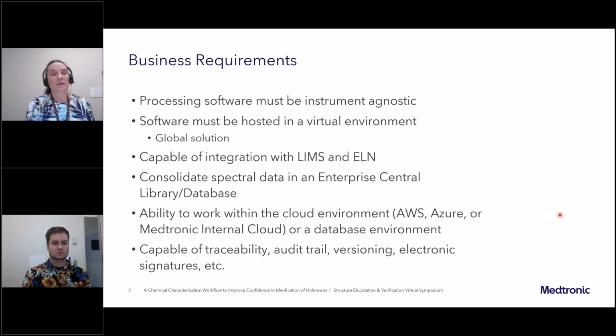We also wanted it capable of integrating with LIMS and with ELN. We wanted to consolidate spectral data in an enterprise central library/database. That library/database we wanted to be portable, not necessarily requiring to be in an Oracle database or, fill in the blank database.